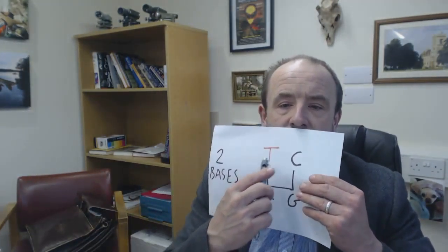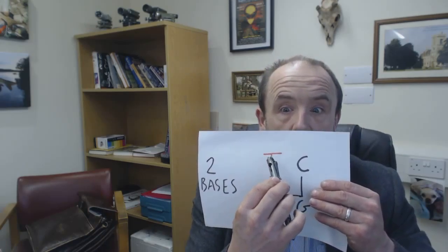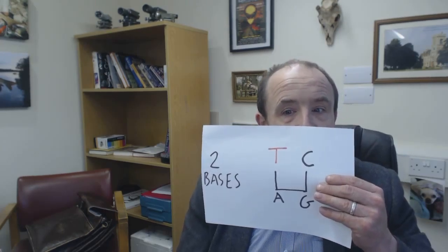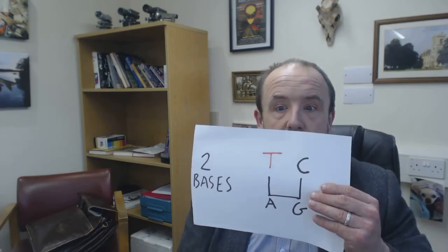But elsewhere in the reaction, let's imagine that in this instance we get a normal binding, a normal C binding, followed by a dideoxy T. Okay, in this instance the reaction will be terminated after 2 base pairs.